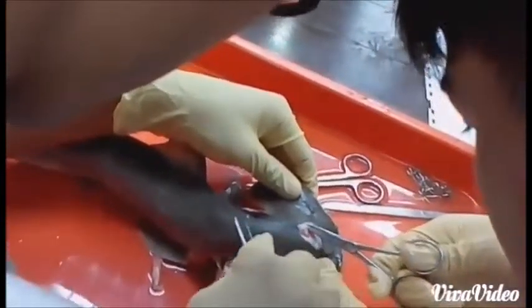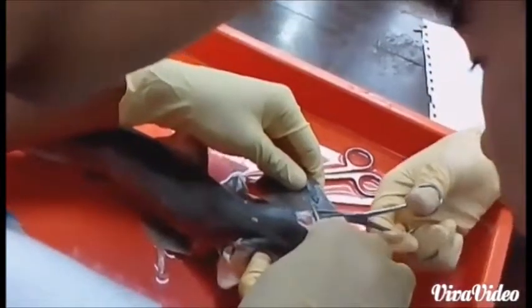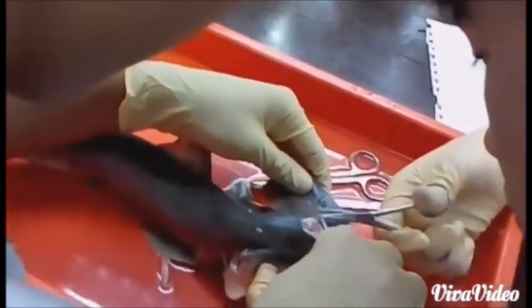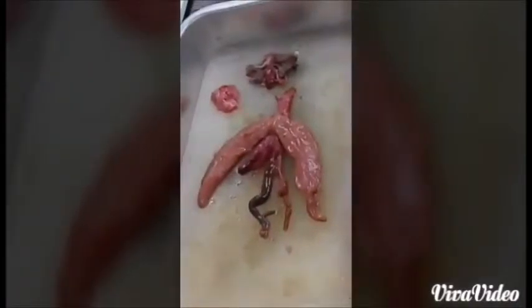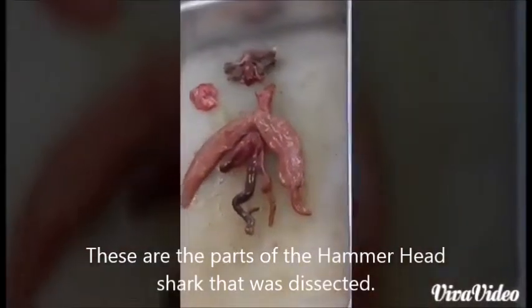The cartilaginous part of this hammerhead shark is widened up by using a small pair of scissors. These are the parts of the hammerhead shark that were dissected.